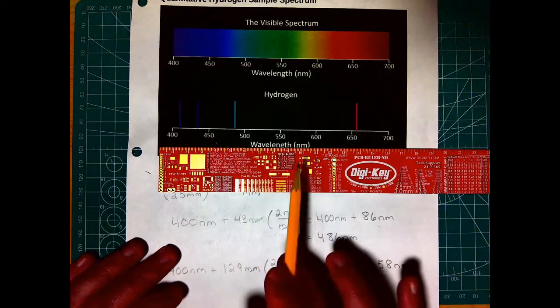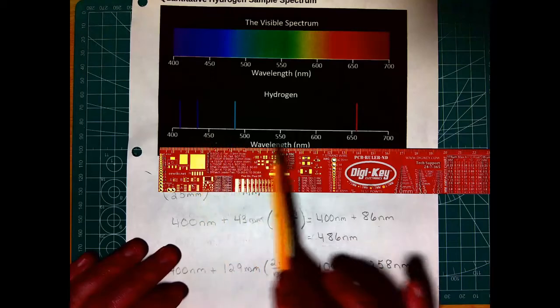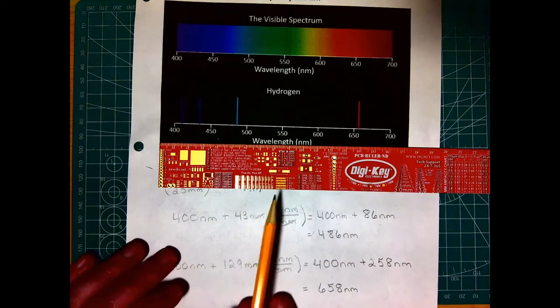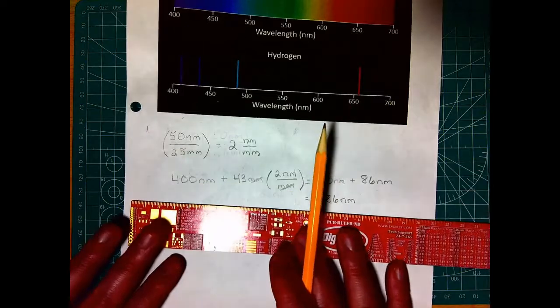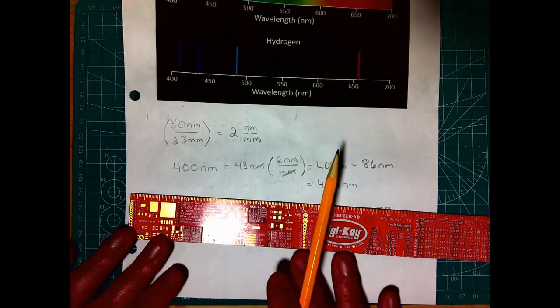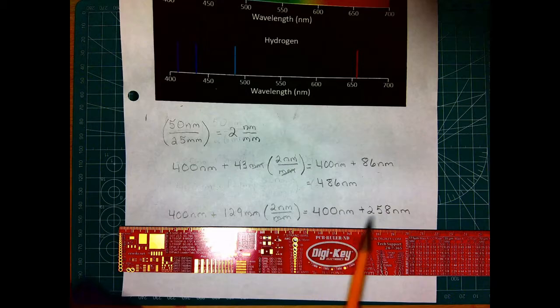That's the beauty of this technique: it doesn't really matter what this looks like, so long as this scale is here for us to work with. We get pretty good values, not quite as nice as we could with some more sophisticated techniques, but given the equipment that we have in this lab and the data that we're given, these are going to be pretty good values for you guys to use to make up your graphs later.